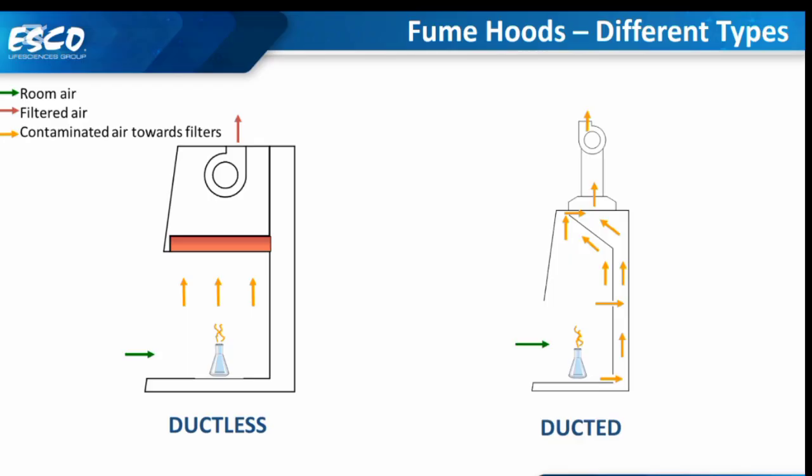There's normally a pipe, what we call duct, a canalization that is connected on the fume hood and to the external fan, which releases all this fume into the environment. So basically the ducted fume hood is for the operator's protection. The ductless fume hood is for both operators and environment protection.